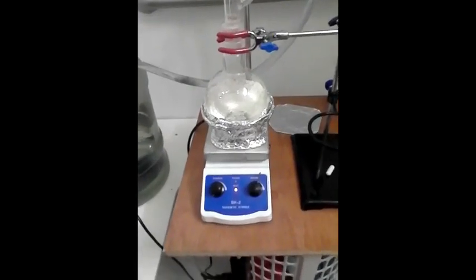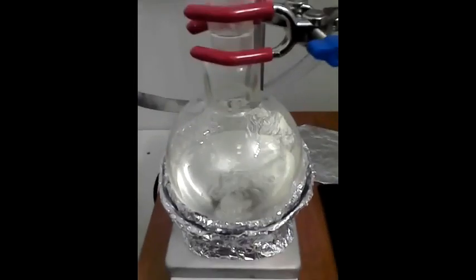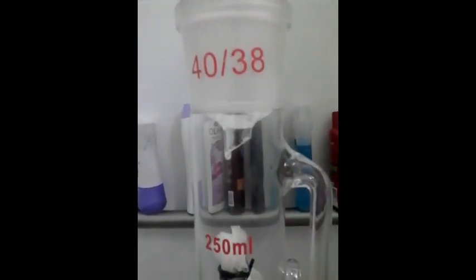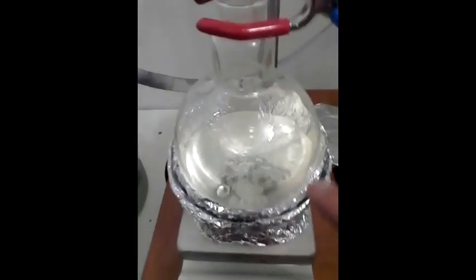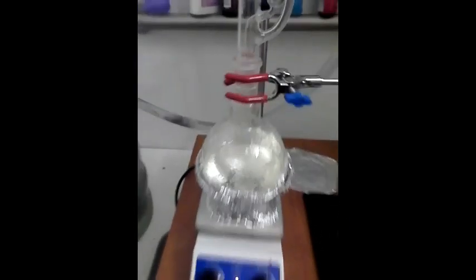Hey everybody, what's going on? This is a quick update on what's happening. As you can see, it's come to a good boil, and it's sitting right there right now. It's a light, pretty green. And as it slowly drips back down into there, this will fill up, go up to about here, then drain back down into there. I'll keep you updated and keep you posted.